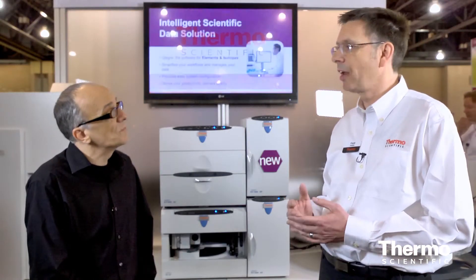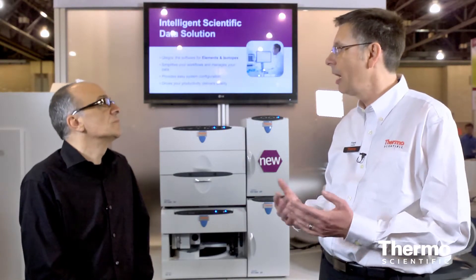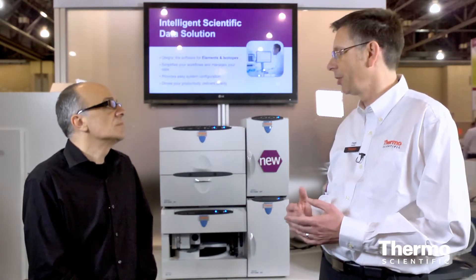It gives a huge advantage in the area of very complex matrices such as food matrices, biological samples, and wastewater — one of our key domains for ion chromatography.